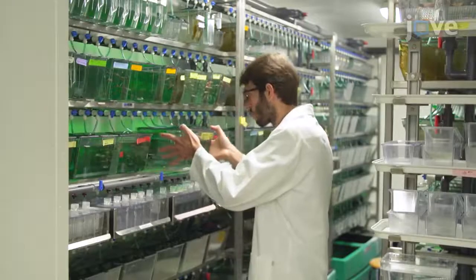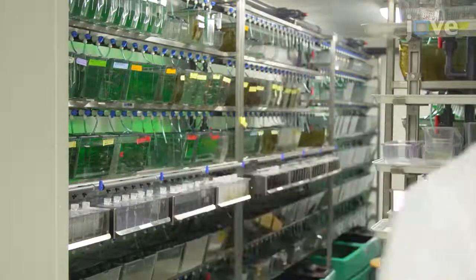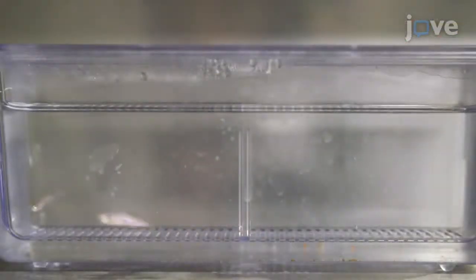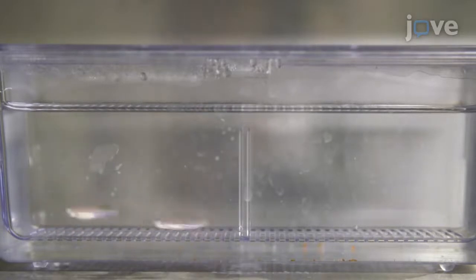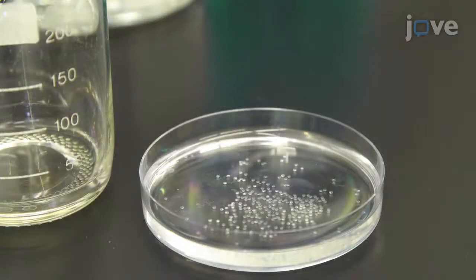To begin the protocol, prepare the zebrafish embryos two days post-fertilization, or DPF. On day one, set up several crossings of the zebrafish strain of choice. On day two, mate the fish and collect the eggs directly after spawning in a plastic 10 cm petri dish.